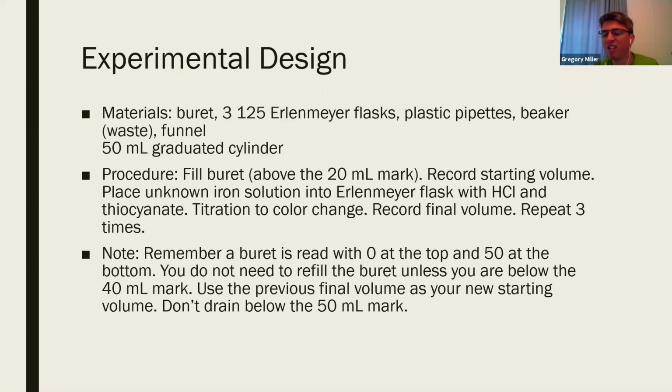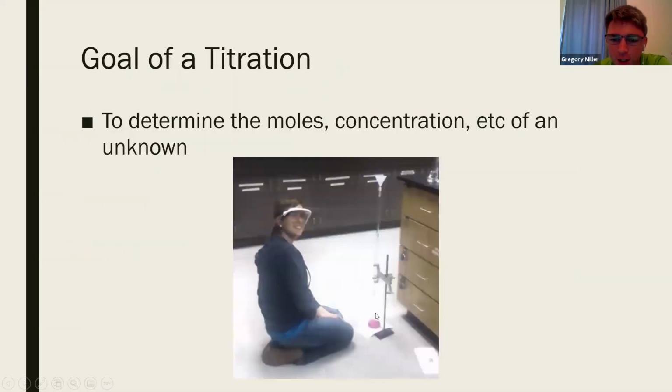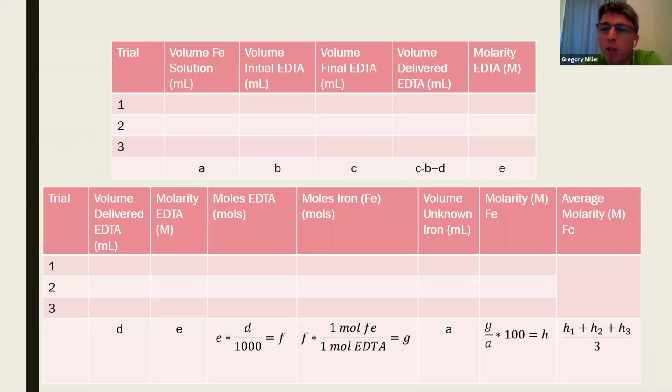If you have to refill it, you refill it, and you'll keep doing the titration until it goes from clear to pink. So if you look at the bottom of this picture, there's a kind of pink solution. What you'll notice me do is it starts clear, and then as you add more, it will eventually turn pink. And so again, I'll talk in a little more detail about titrations in next week's antacid video. This is really just to get you introduced to it.